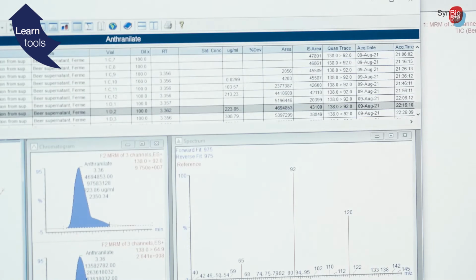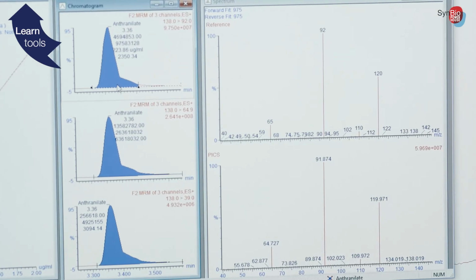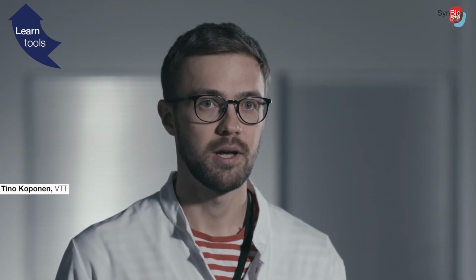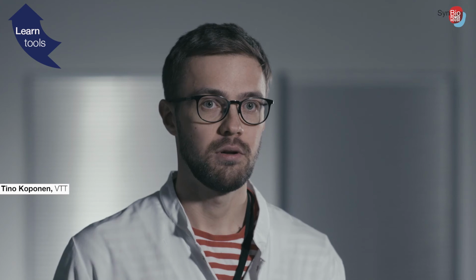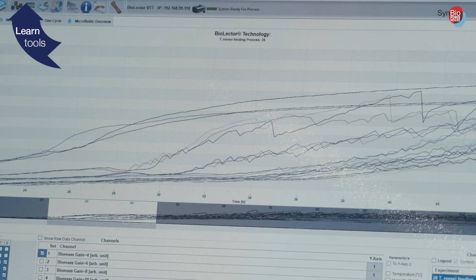After testing, the DBTL cycle continues to analyze the experiments and incorporate what has been learned into the next cycle. And the basis for the learn phase is all the gathered data. The high throughput power, that's a very cool thing, that we can have so many individual experiments simultaneously, and we can gather so much data out of one day of work.